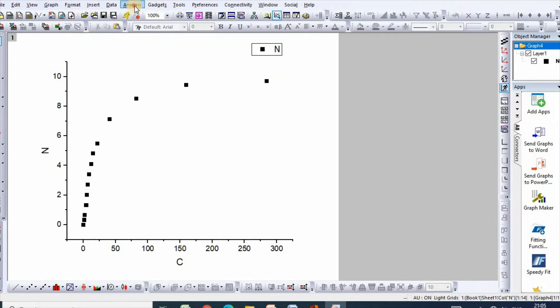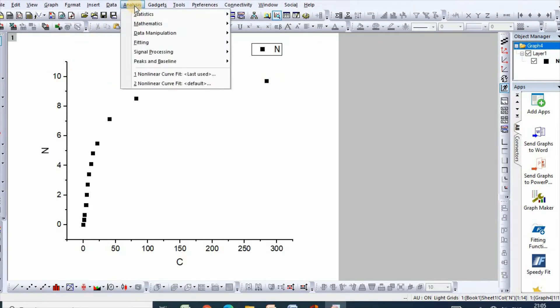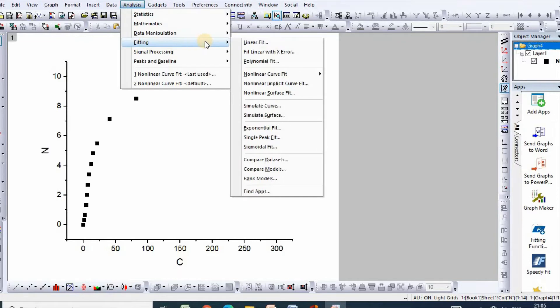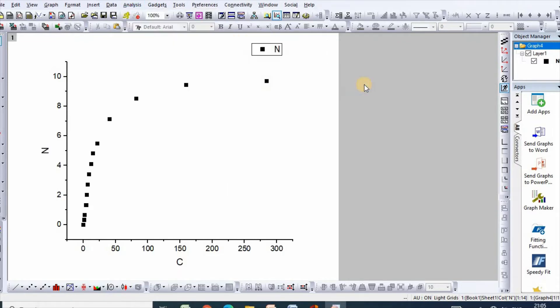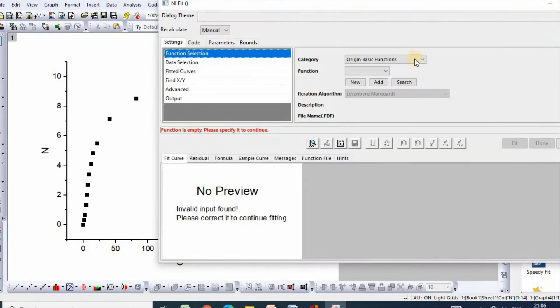Now click Analysis, then Fitting, then Non-linear Curve Fit with Open Dialogue.